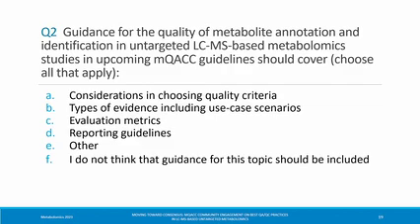Yeah, this is Phil Britz-McKibbin from McMaster. Just to add on to that suggestion, I guess a higher level of confidence would be to have a rank score function if you compare an analytical standard to your unknown compound by characterizing the MSMS, not only in terms of 2 or more diagnostic fragment ions, but also the relative intensities. Yeah. And coelution. What was the last part? Coelution, with the retention time, of course. Yes. Awesome.